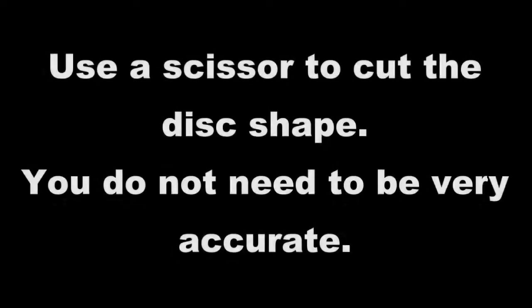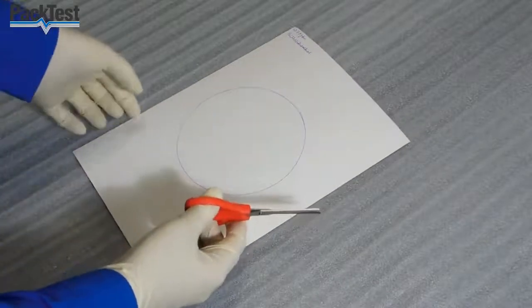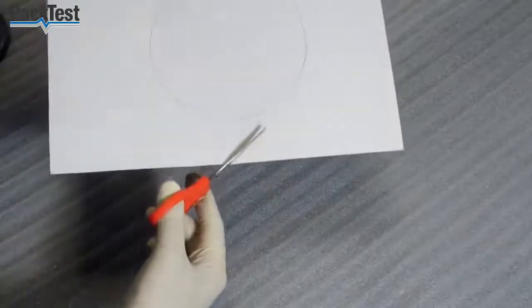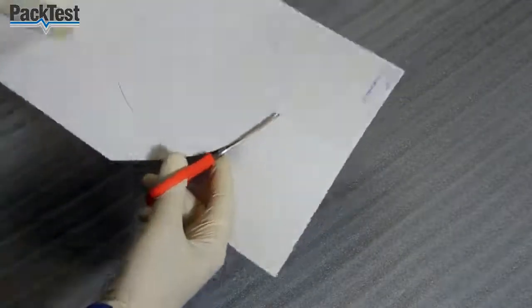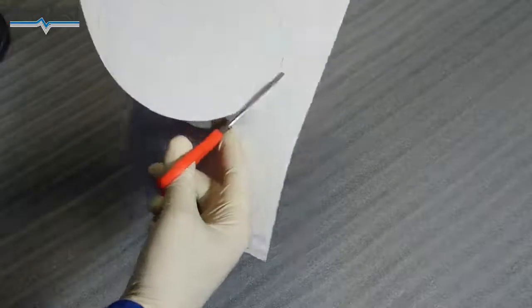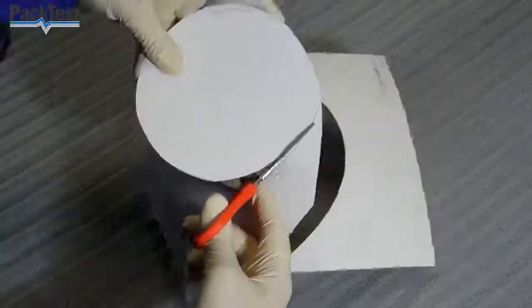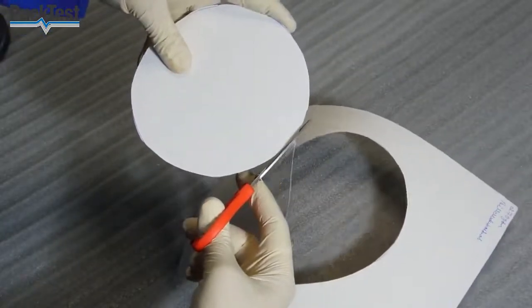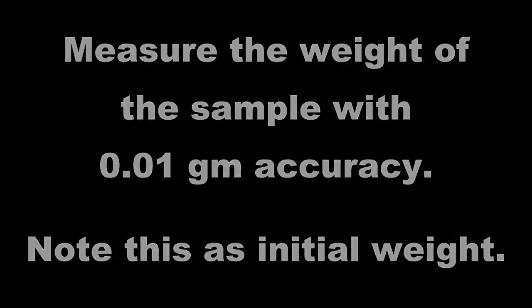Use a scissor to cut the disc shape. You do not need to be very accurate. Measure the weight of the sample with 0.01 grams accuracy. Note this as initial weight.